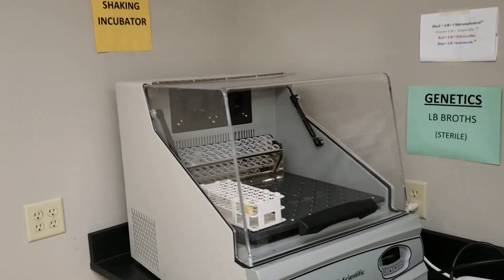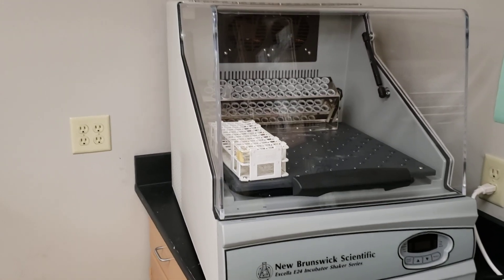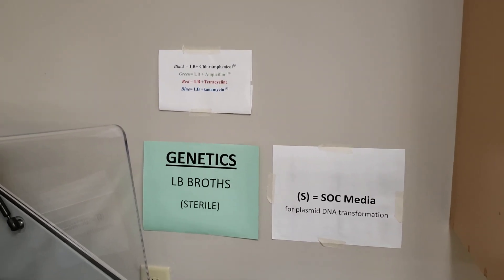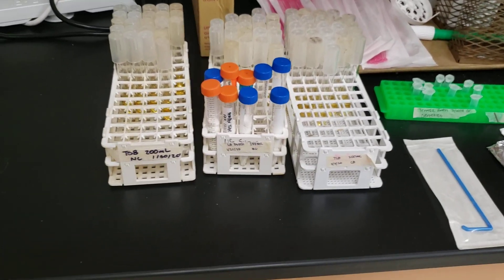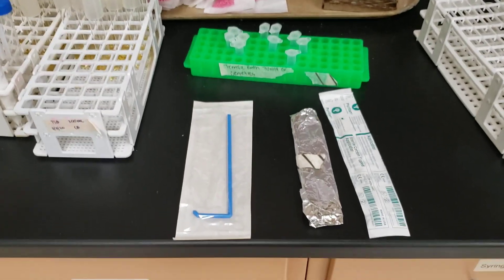I have a shaking 37-degree incubator, which is very important for growing plasmid cultures — students can open it up and access it easily. I also have a label system so students can see what they're using. Next to the incubator I have all the broths they may need, including terrific broth and SOC broth for their transformations.